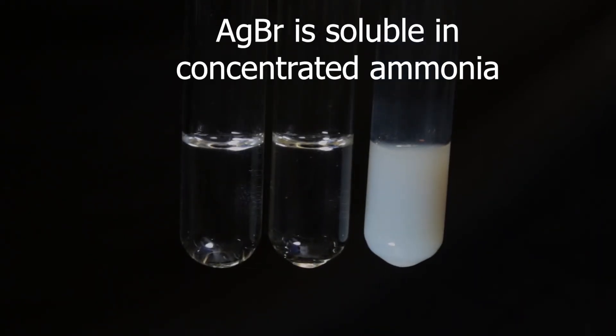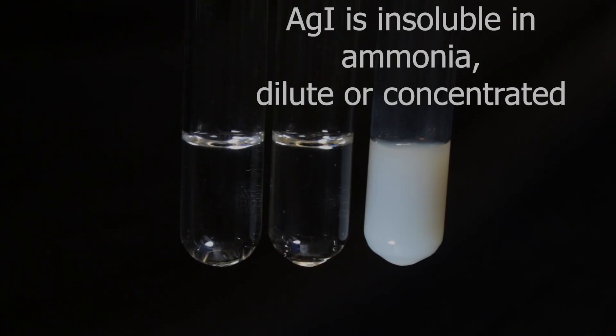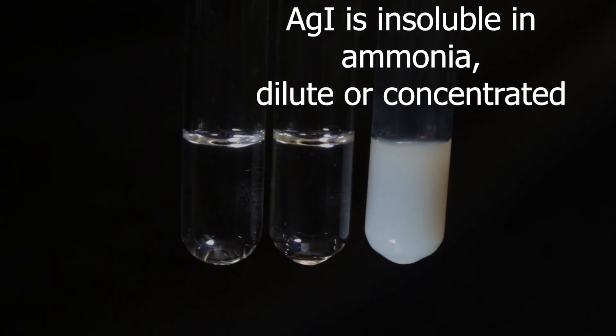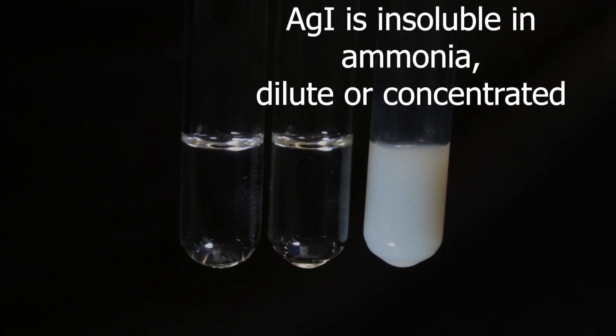There is no effect on silver iodide. Silver iodide is not soluble in ammonia at all. That's how we distinguish the precipitates.